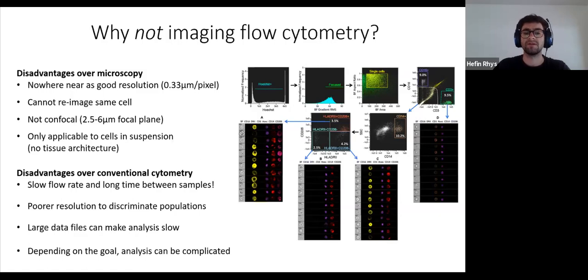Depending on the goal, your analysis can end up being quite complicated, and often the acquisition of samples takes less time than the actual analysis, depending on what you're doing. If you're doing something very simple, it may not take particularly long, but I find that most analyses that we do, it's a long process of making sure that the analysis that you've done is appropriate to answer the question that you've set out to answer.